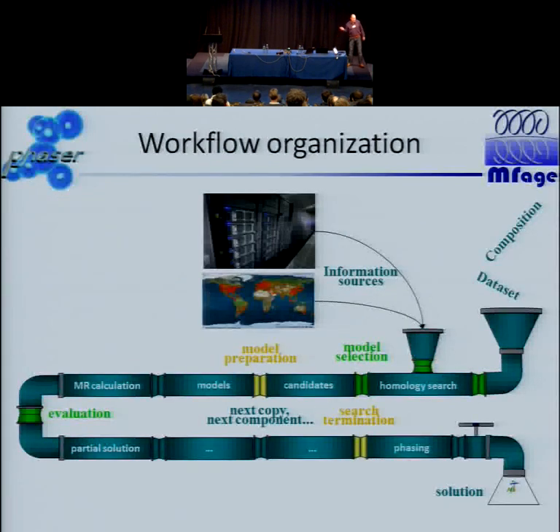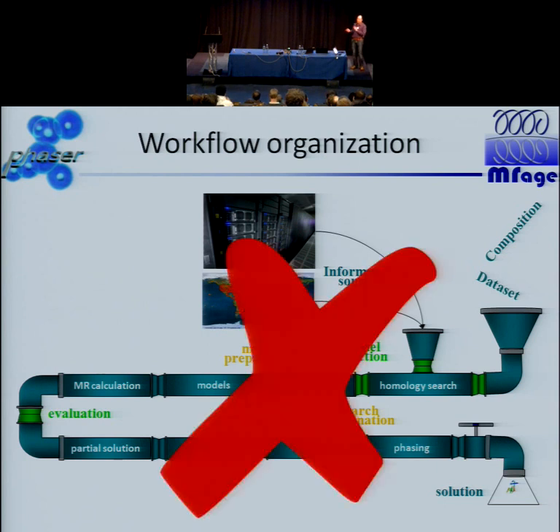So this is how we actually think of a pipeline. We start somewhere with data, we also throw in some resources, and we come through in a linear fashion to the end. Now this looks very nice as a picture. It's actually too nice to be true, and this is reality. There are so many places where we can skip forward and go back that this single pipe would rather look like the clumsy and patchy plumbing of a British house. So this is not how we are doing this.